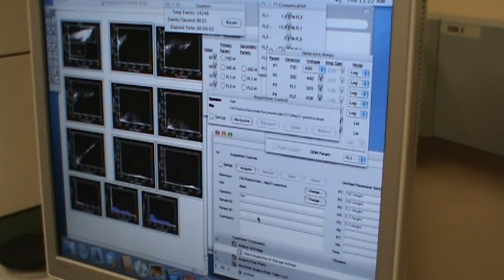So after you run the experiment, just when we want to start, it looks like the computer just froze. Yeah, that's a problem.